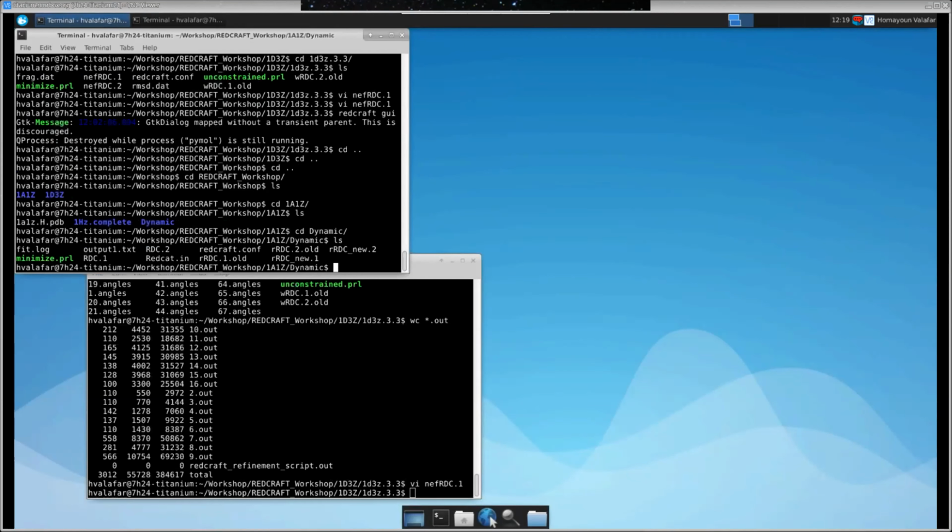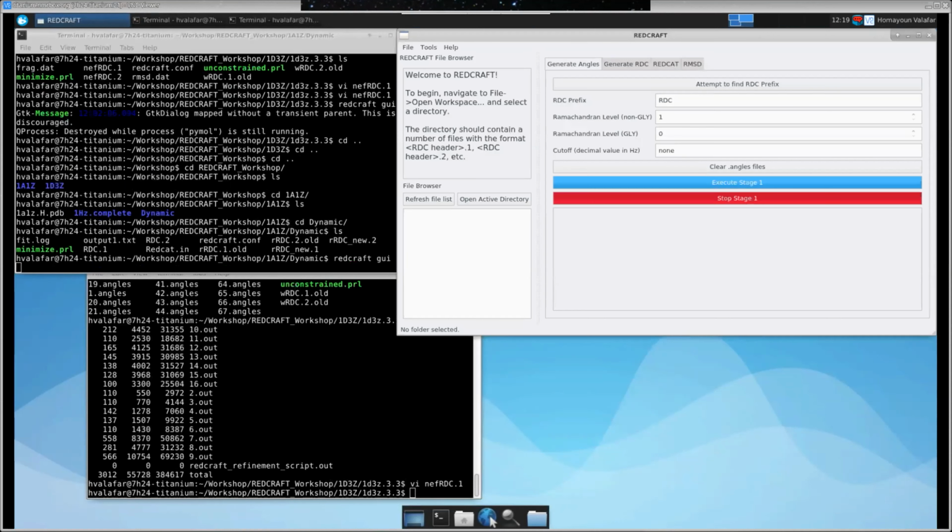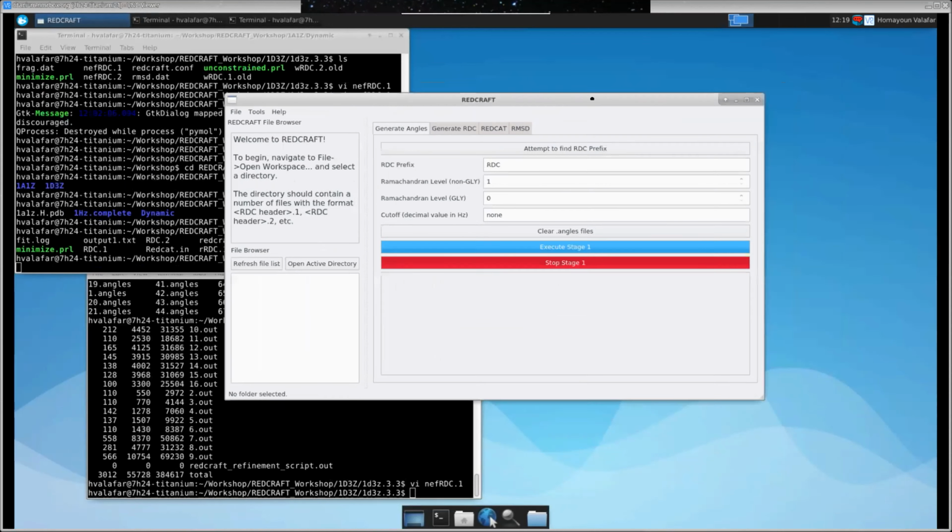It's not a big deal. In this particular instance of 1A1Z, I have subjected 1A1Z to two-state jump motion, where a portion of the protein is jumping between state 1 and state 2. And I have created residual dipolar couplings from that averaged RDC. Now, the question becomes, how would dynamics manifest itself in our studies?